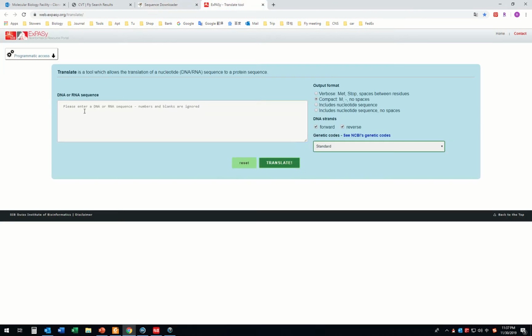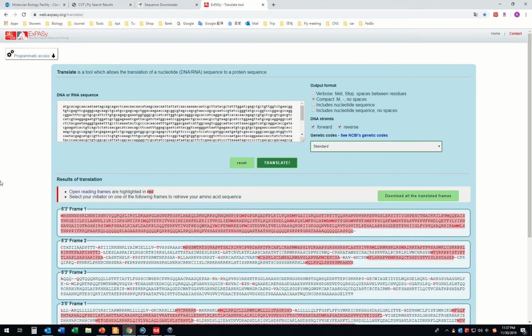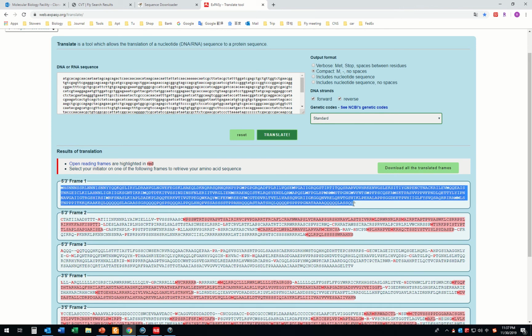RA, copy, translate, forward translate. This is the first one.